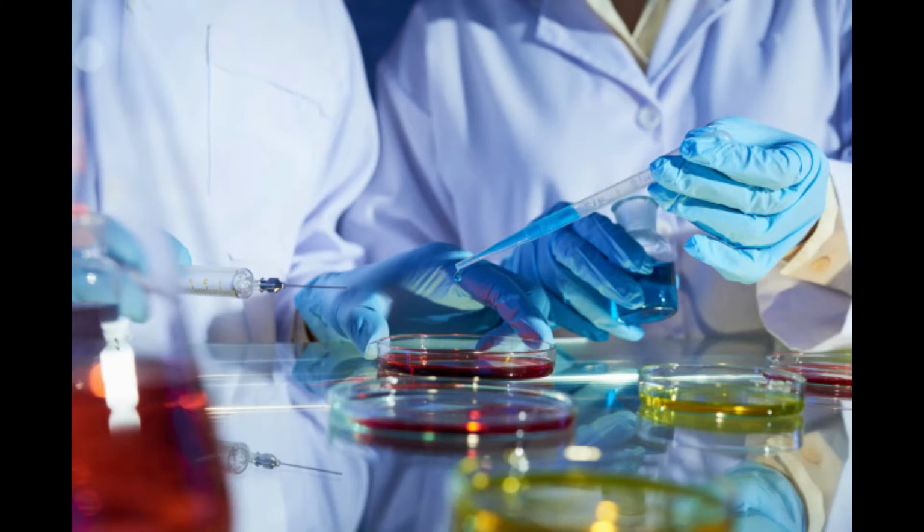And then I listed up here just the terms that are in your lab manual of what it means to transfer aseptically. Your goal is to not contaminate yourself, to not contaminate anyone else, to not contaminate your table or anything around you, and that your culture and your sterile media only have the Serratia marcescens in them, that you're not introducing any other microbe into that. Let's talk about your microbe for a second.